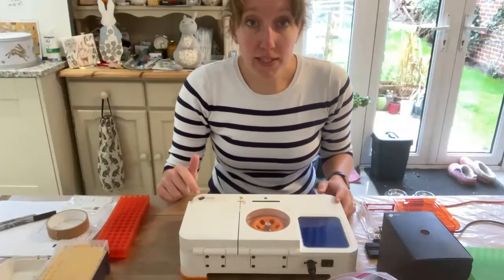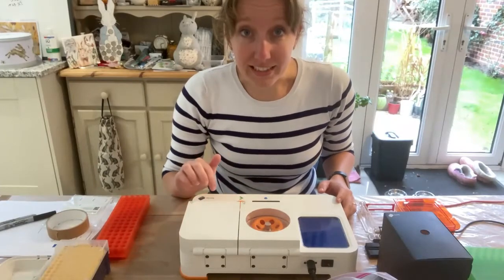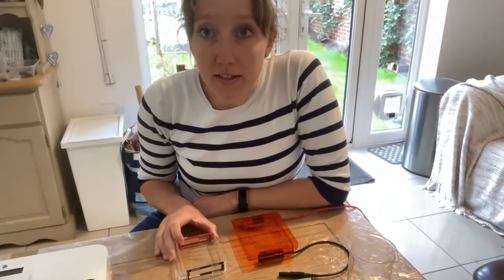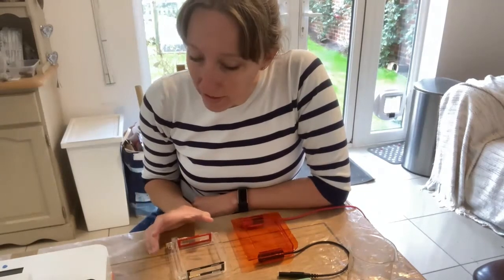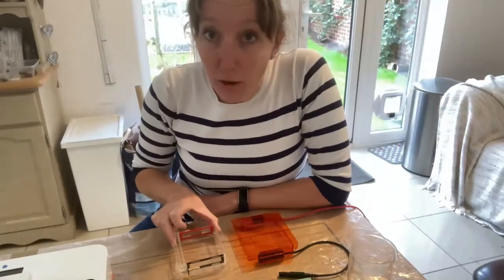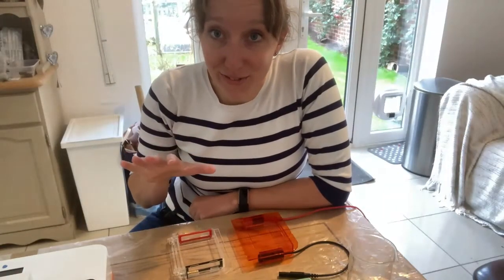When I'm putting a PCR on and setting up the programme, I'll be sitting here. And when I'm pouring a gel, loading my PCR samples onto it, running it on the Bento Lab, or putting it onto the blue light to visualise, this is where I'll be — at the post-PCR end of the table.